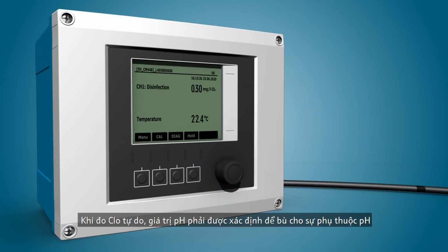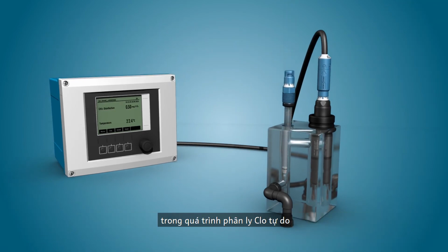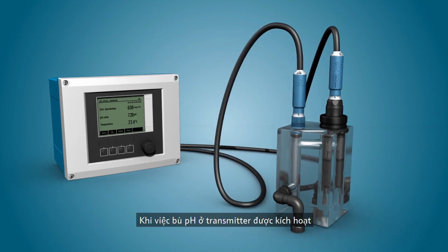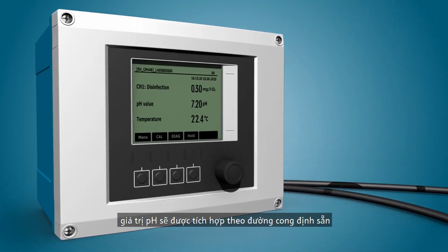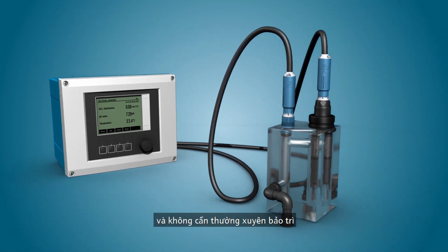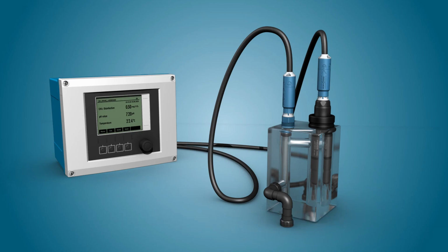When measuring free chlorine, the pH value must also be determined to compensate for the pH-dependent dissociation of free chlorine. If the pH compensation of the transmitter is activated, the pH value is included according to the preset curve and the transmitter displays true measured values. The amperometric measuring principle enables a continuous measurement of the chlorine content and requires very low maintenance. It helps to optimize chlorine dosing and reduces operating costs.